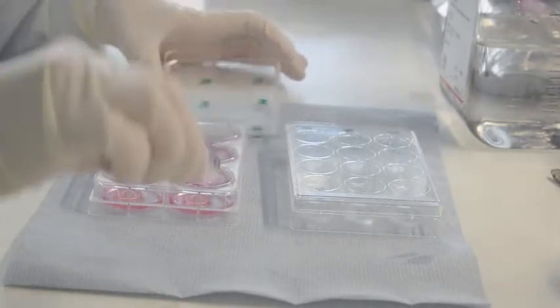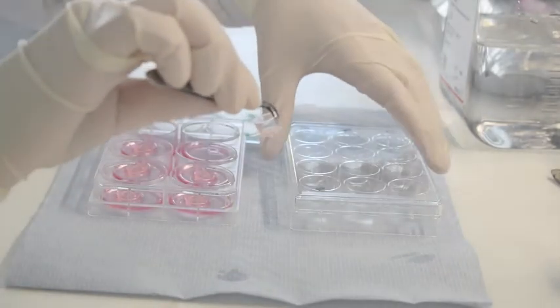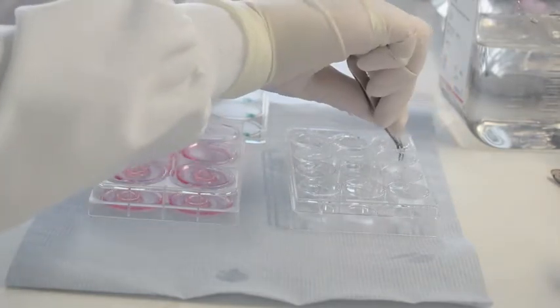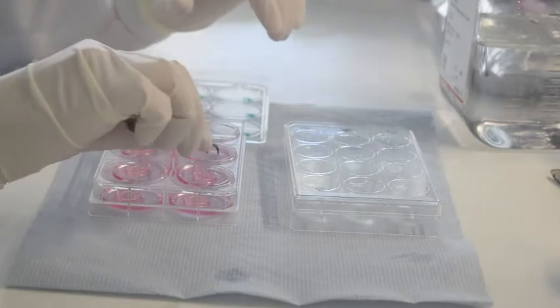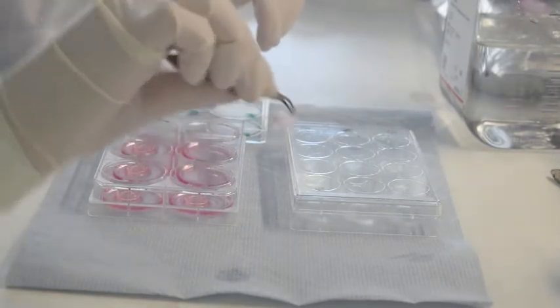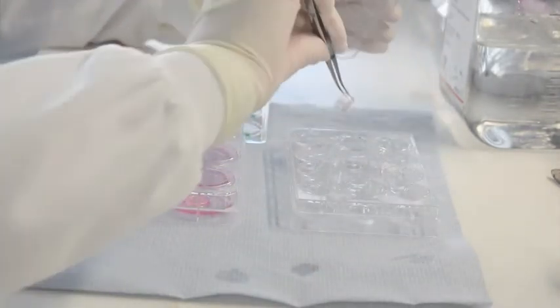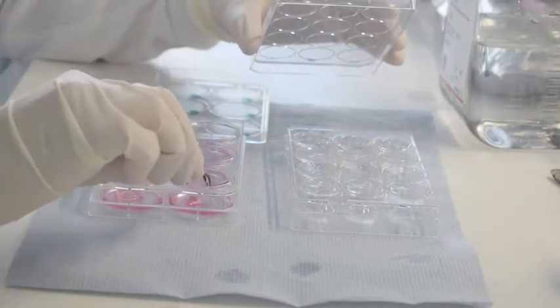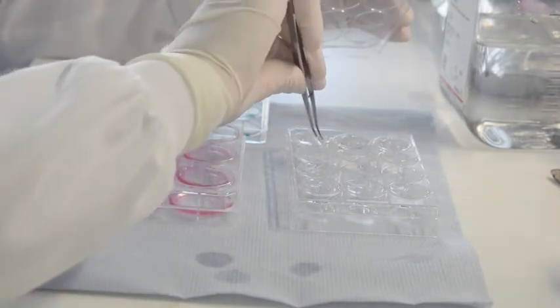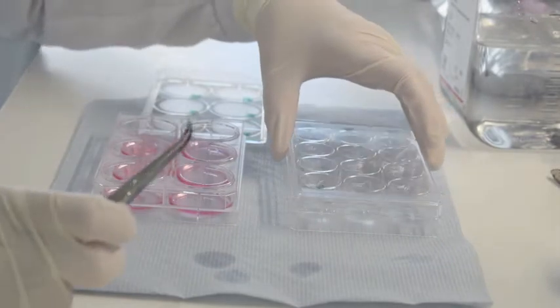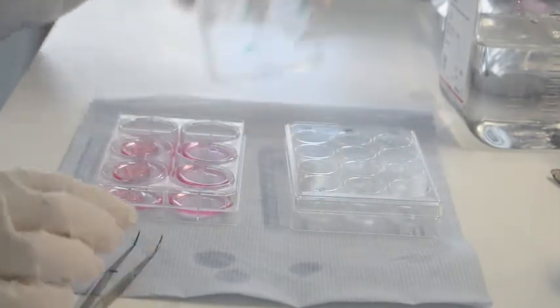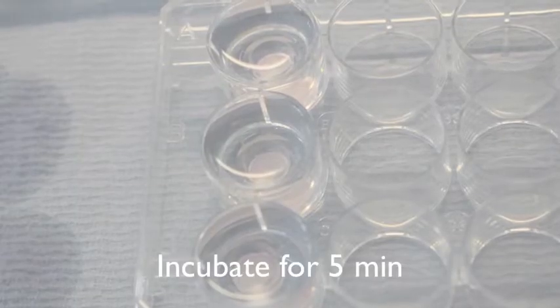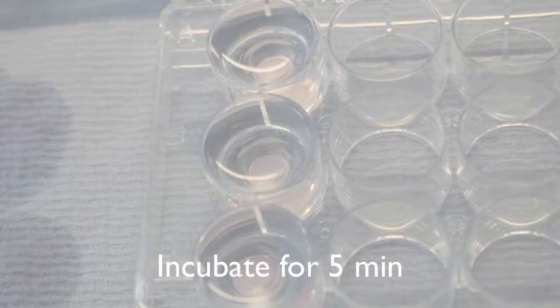Tissues are removed from the culture plate, excess medium is dabbed off, and tissues are then lowered at an angle into the 5 millilitres DPBS. Tissues remain in the DPBS wash for 5 minutes.